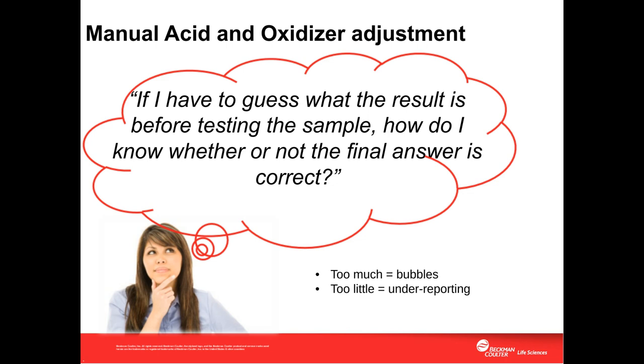Now, here's an example where manual SOPs can lead to error and inaccurate records. In some commonly used QC lab TOC analyzers using carbon dioxide permeable membranes as part of the measurement process, the users, the technicians, have to guess how much oxidizing persulfate to add. In other words, they need to know the level of TOC present in the sample before they carry out the test. But how can they know this?